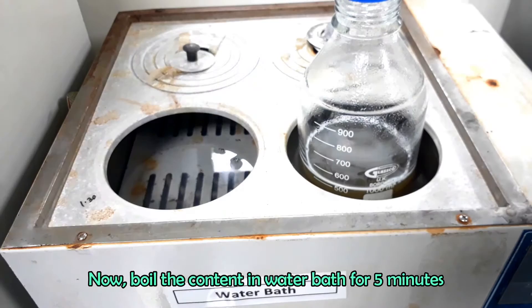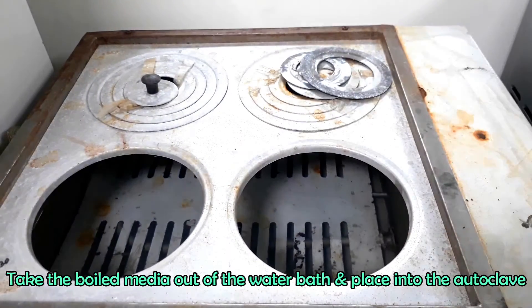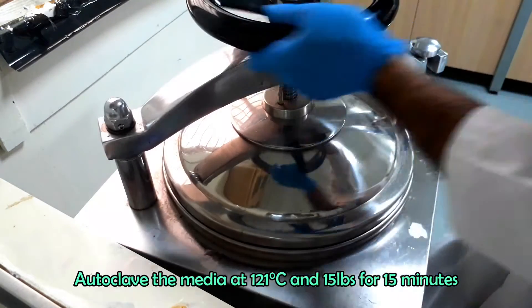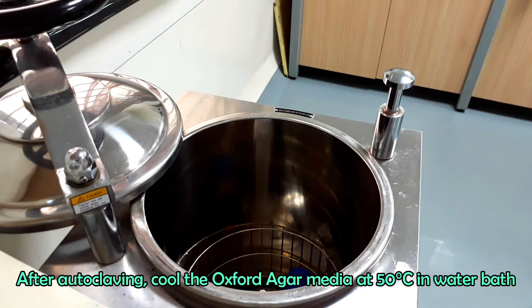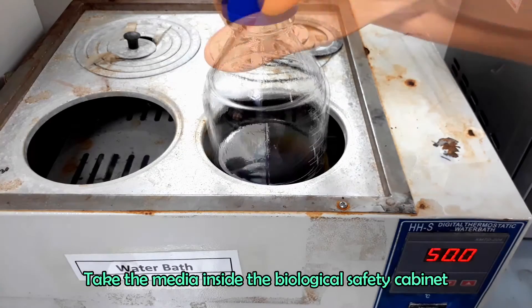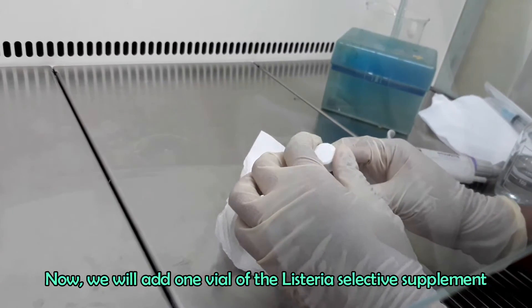Boil the content in a water bath for five minutes. Take the boiled media out of the water bath and place into the autoclave. Autoclave the media at 121 degrees Celsius and 15 pounds pressure for 15 minutes. After autoclaving, cool the Oxford Agar media at 50 degrees Celsius using a water bath.